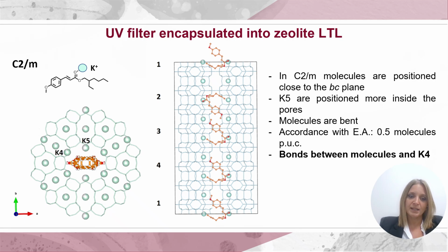But the most important thing that we can discover thanks to X-ray powder diffraction is the interaction between the molecules and the framework, because through X-ray powder diffraction we now know that the molecules establish a strong bond with the potassium inside the channels. So it's not just a long interaction with some atoms really far away. The molecule is truly stuck inside, with a bond with the potassium of our zeolite.